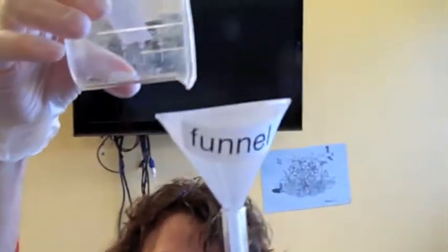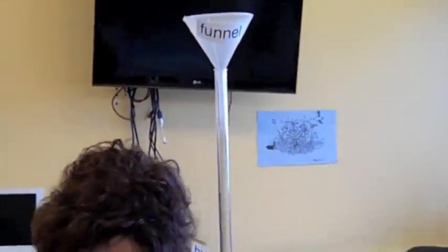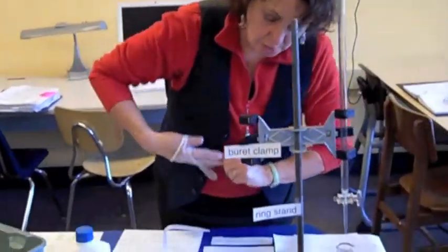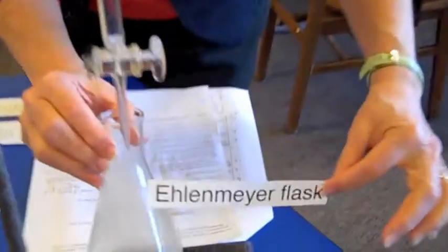The funnel will be what you pour your approximately 50 mils of hydrochloric acid into the burette with. You also will need a wash bottle with distilled water, which is right here. You'll need an Erlenmeyer flask. This is the fancy name for this type of flask.